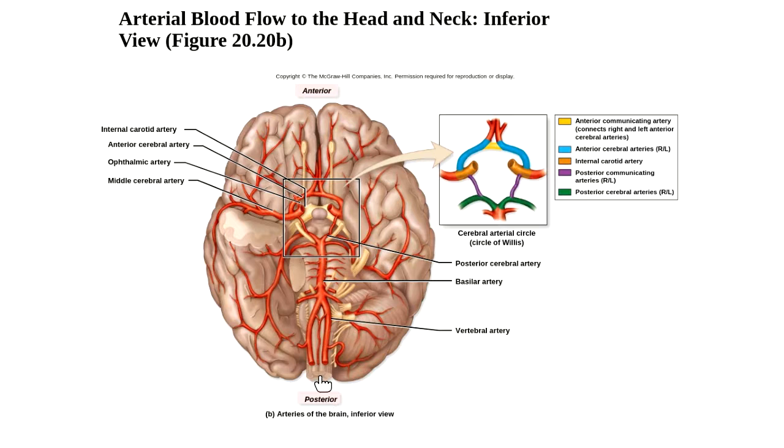And so here we can even see the spinal cord coming in. When we look at this, we see these red vessels. It almost looks like there's a head. It looks like there's a body. Here's some legs. Some weird arms. And he's got some wicked little deer antlers and some odd looking ears, right? So that's kind of what we're seeing, this weird alien looking fella, right?